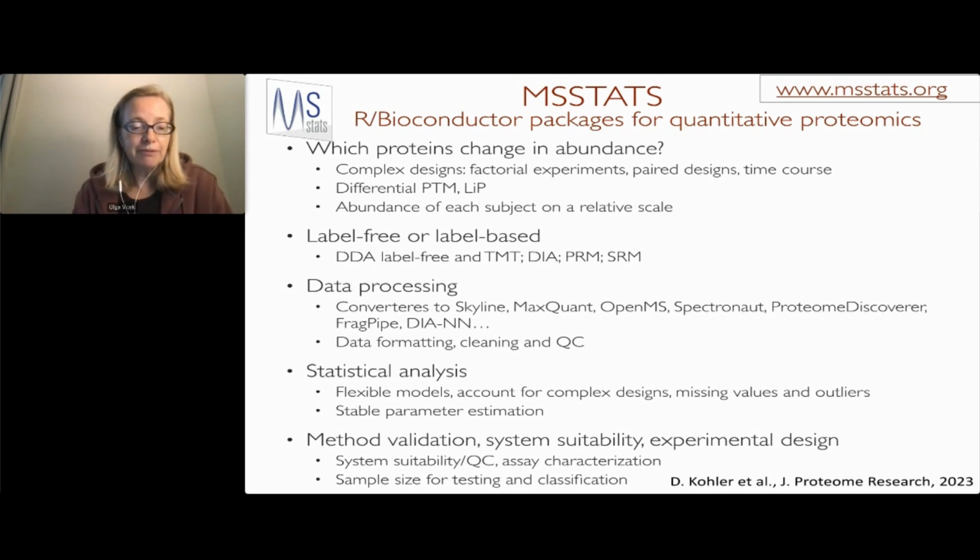If you use decoy sequences and these decoy sequences somehow made it into the data set, we can eliminate that. We can eliminate features which have too many missing values, or we have options on whether, for the purpose of protein-level quantification, we keep just the unique peptides, or if we also allow shared peptides.